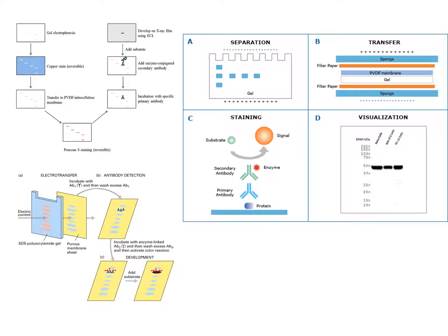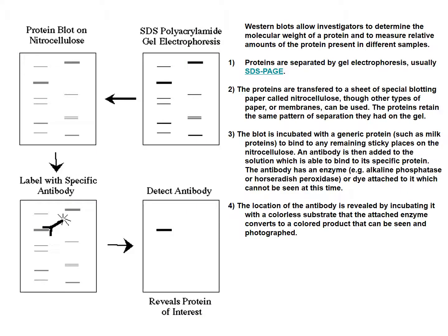This is just another figure pretty much showing the same things, just a different way to look at it. I like to show you different things. And here's 3 different samples or cell lines or fractions or organelles, and it looks like the proteins in all of them. Okay. And here's another one showing the primary secondary antibody here. So that is protein blotting.